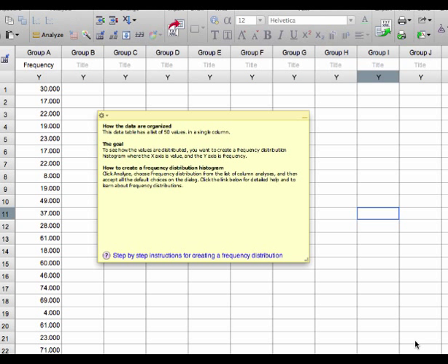And the great thing about GraphPad Prism is that when you click create, it creates a file for you with a sample data for the test. This gives you a guidance as to how to input your data for the analysis to be done. This is very useful. If you have used the other statistical programs, what you will find is that you get a data entering browser and you don't know quite how to put the data for the various tests.